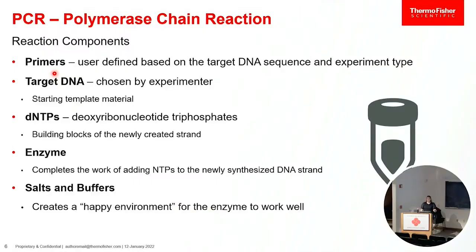I've got some pictures for this, but they're little 25 base pair starter molecules. And because we can define where those are and make a specific sequence, we can amplify specific things in our target. Then we've got target DNA. This is our starting material for our amplification process.